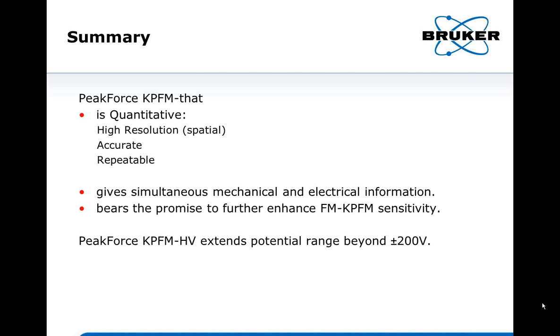A question about the work function. If the work function of the tip is known, then can you measure the work function of the sample? Do we know the work function of the tip? Yes. So again, you can calibrate the tip. Actually, we know the work function of the tip for the probe we provide. So in the software, we have a parameter. You can type in the work function of the tip, and then it will automatically calculate the work function of the sample. It's built in.